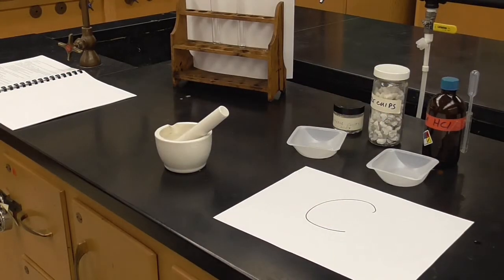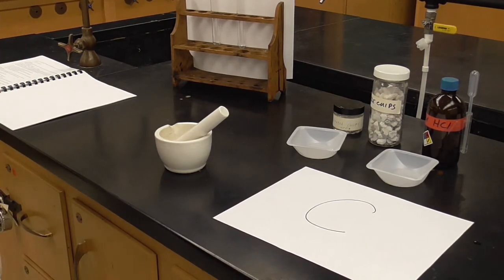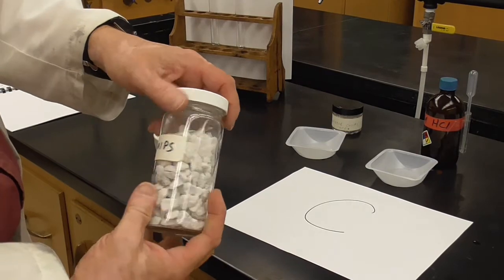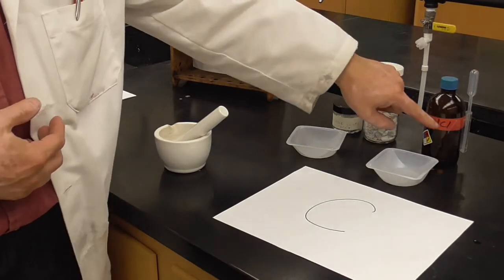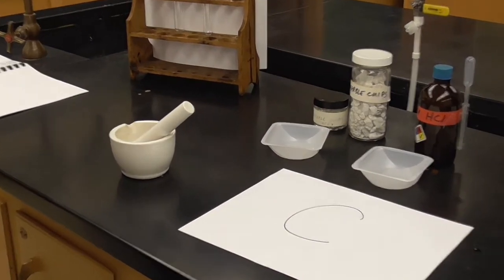Part C. Here we're looking at surface area, and so how much of the reactant is available for reaction? Is it on the top, is it on the surface, or is it buried inside the particle? For example, here we have marble chips, they just look like rocks, right? These are actually calcium carbonate. And calcium carbonate will react with hydrochloric acid to produce, again, gas, this time CO2 gas, carbon dioxide bubbling up.